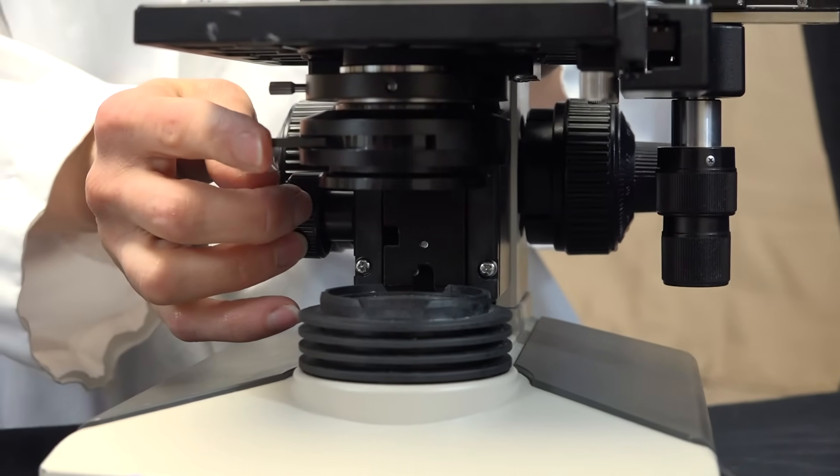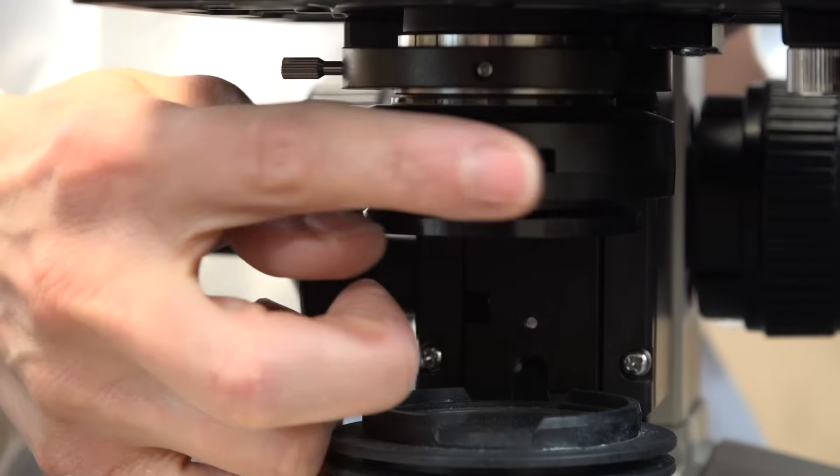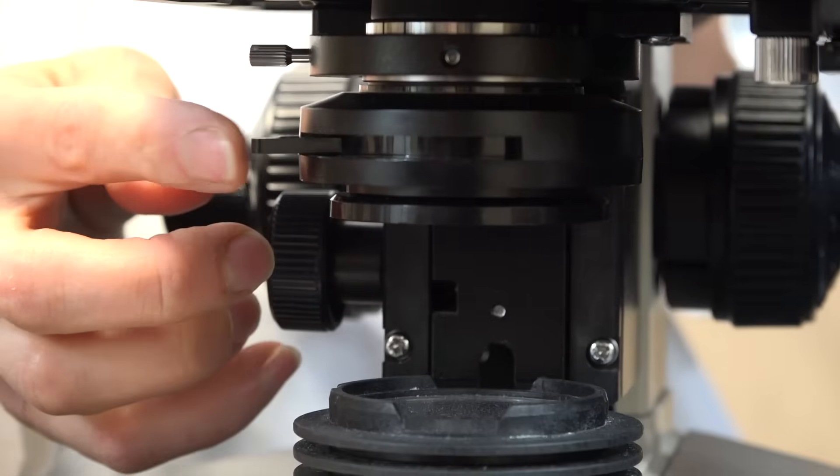On the condenser there's also a small lever. This is the iris diaphragm lever and it controls the amount of light that passes through the condenser.